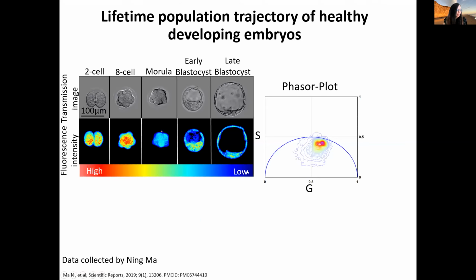As you could see, the lifetime of the signature of all of these different embryos are pretty much dominant on this part of the phasor plot.